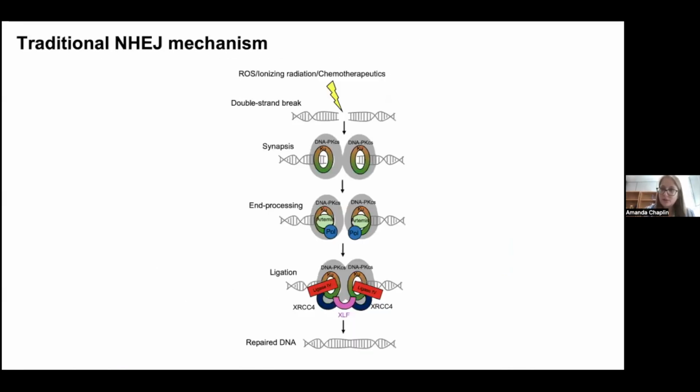So going back to my particular biological question, which is the NHEJ mechanism, we first started by looking at this step of the reaction, which is called synapsis. And this contains Ku, DNA-PKcs, and DNA, which together form a holoenzyme complex called DNA-PK. So I'm now just going to show you lots of cryo-EM structures that we've managed to obtain over the last 6 years or so. We do a lot of biochemistry and biophysical techniques as well, but just to show you the power of cryo-EM and some of the information that we've managed to obtain from it so far.